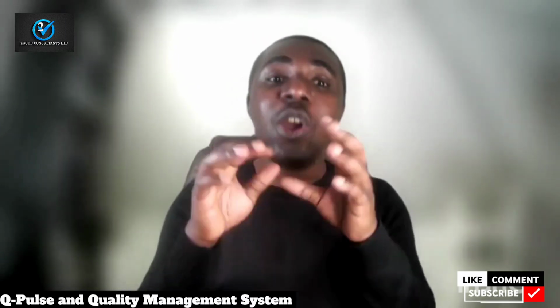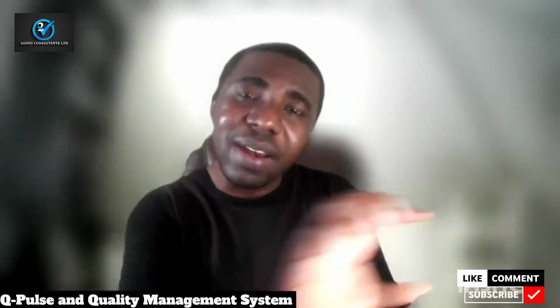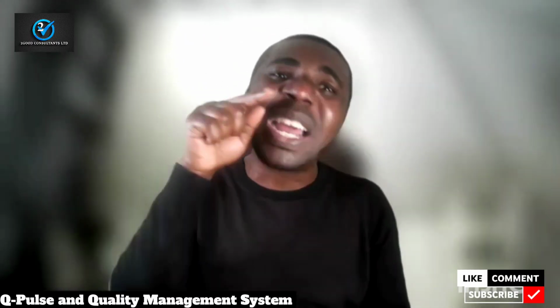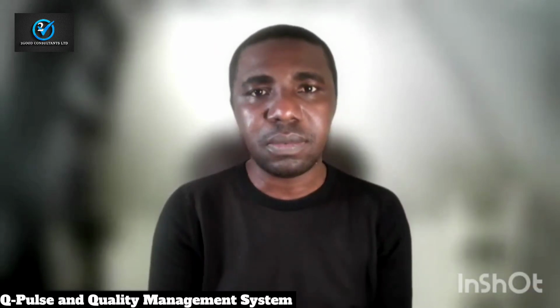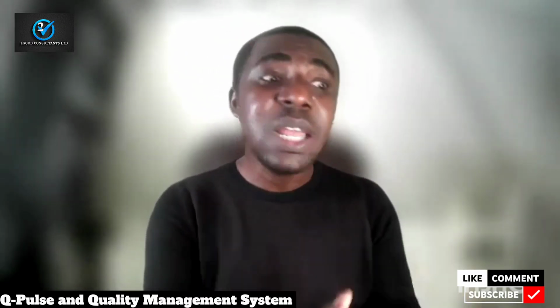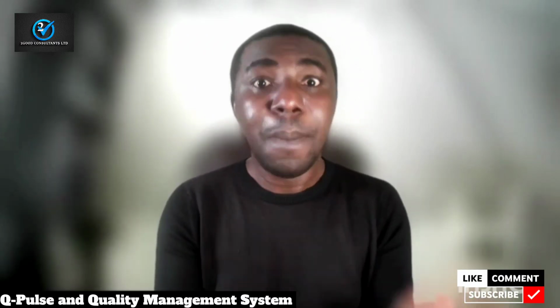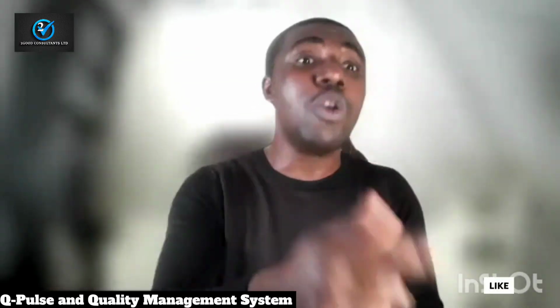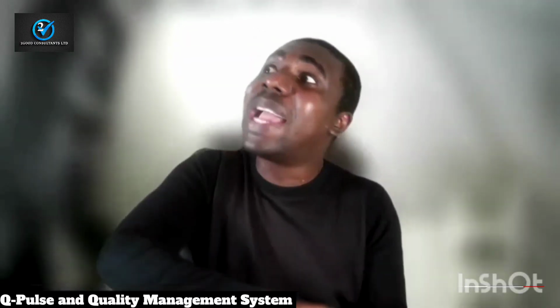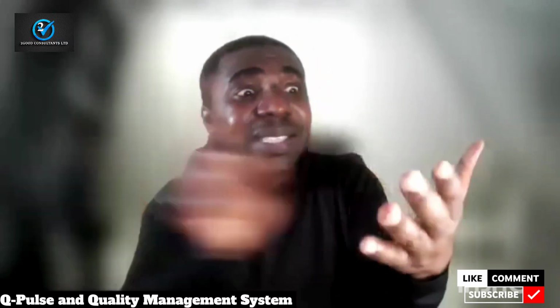Okay, now the whole point I want to make is that if there's going to be accreditation, there has to be a requirement, and if there's going to be a requirement, those requirements must be traceable electronically. We may miss something if we leave it just based on hard copy. Even if they send it and you print a hard copy to go through it, you must always make reference to that electronic version to make sure that I've not missed anything.